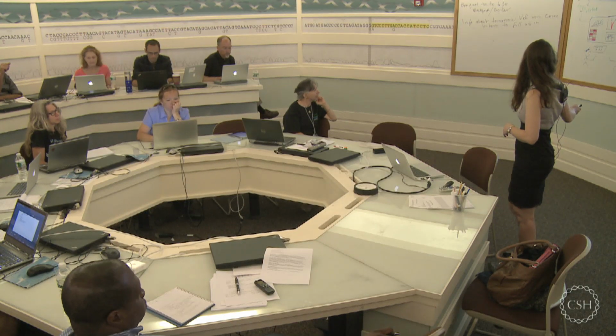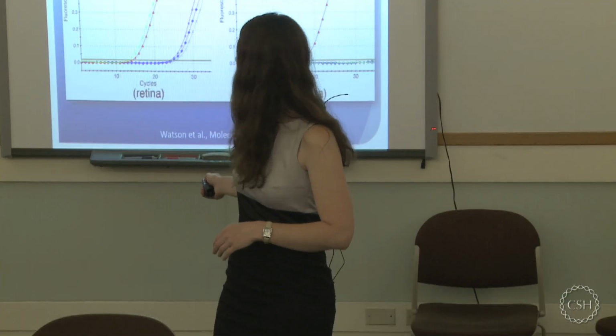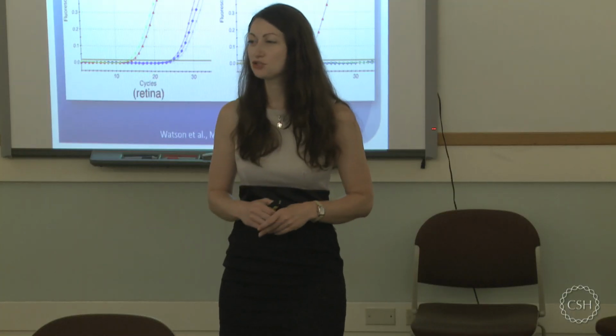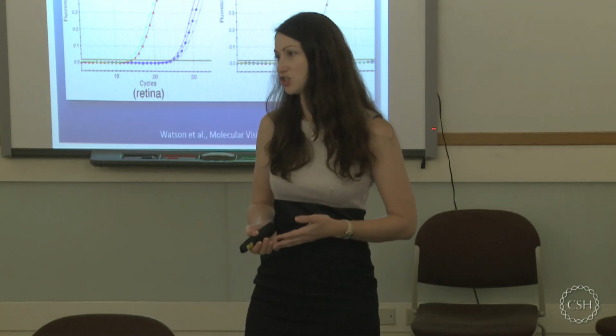So that would be primer pair 2, and as you can see, it has a little lower CT than the other two. So it does affect them, but usually if you run into saturation in the end, you shouldn't see a difference of your primer pairs on the gel.